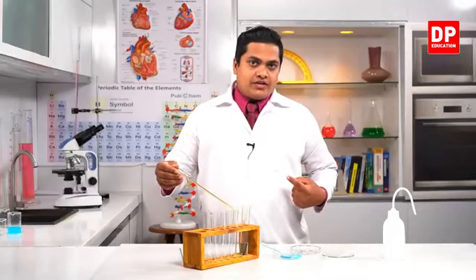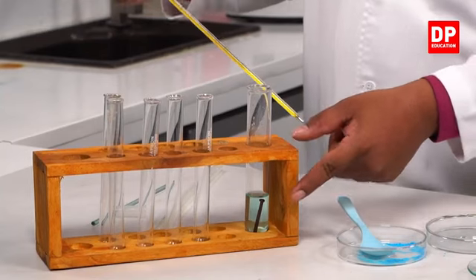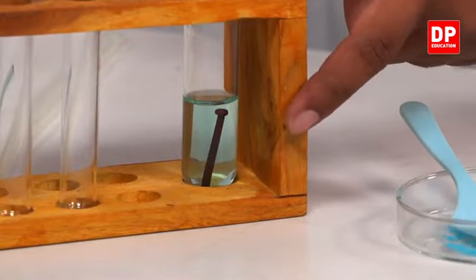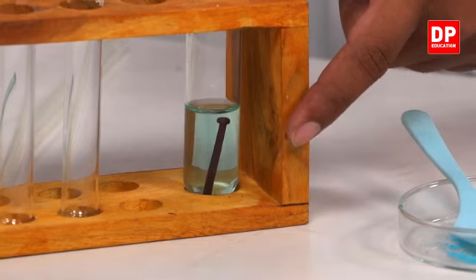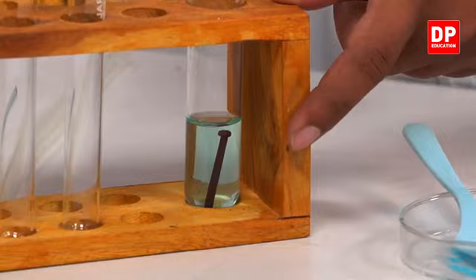Right, my dear children. Now you can observe there is a difference in the color. See, there is a difference in the color. The color has somewhat lightened up. In the earlier case, initially it had some kind of a blue color. Now the blue color has reduced.